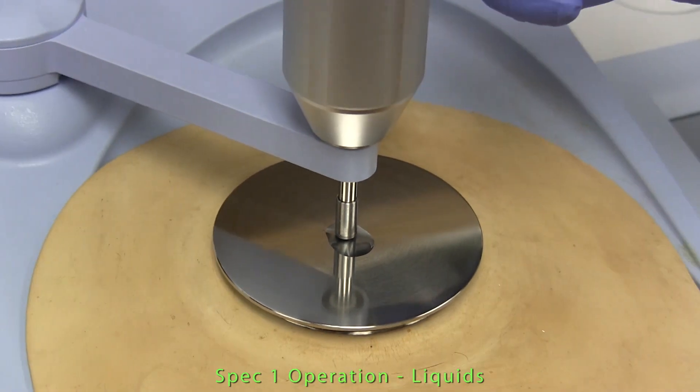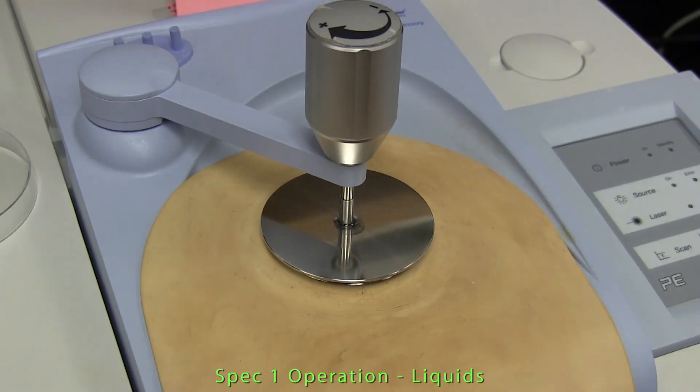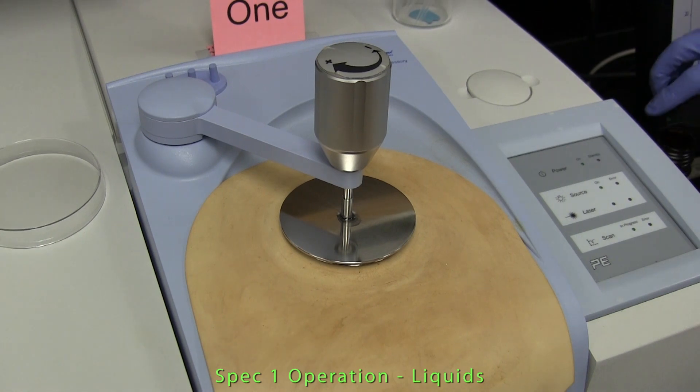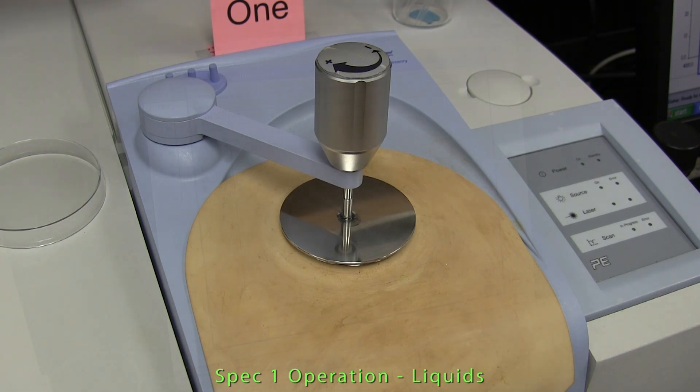No additional pressure is needed with liquid since there is good contact between the crystal and the liquid, but we still place the pressure arm over the top of the sample in this way so as to prevent or slow down evaporation of more volatile liquids from the surface of the crystal.